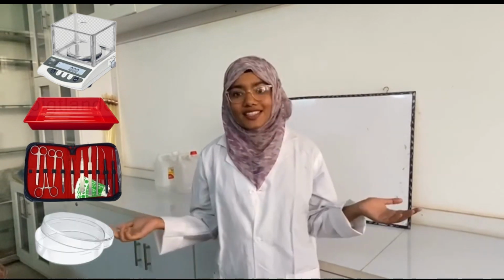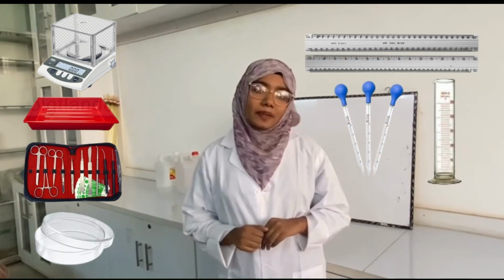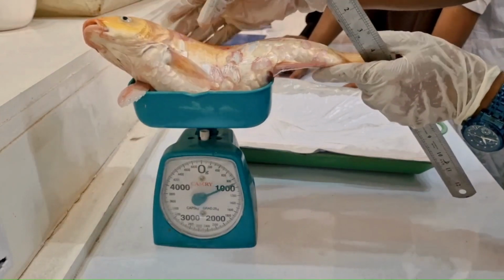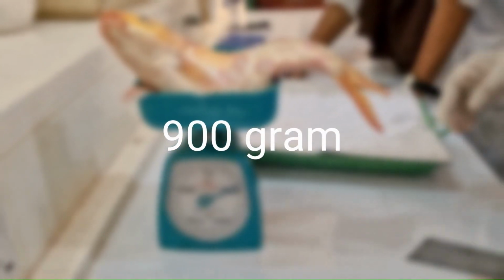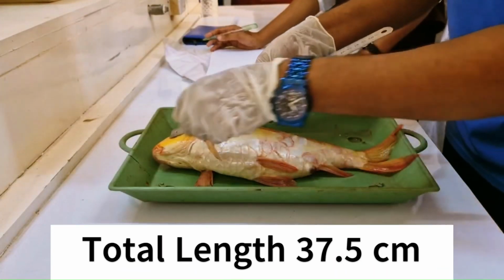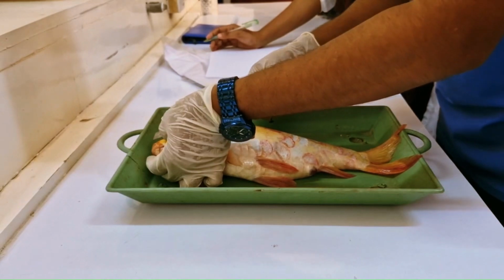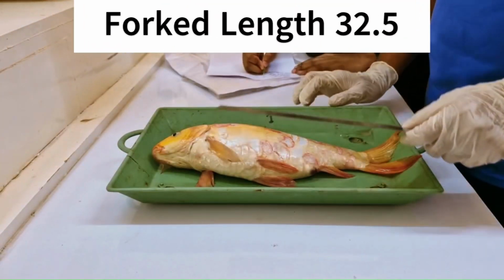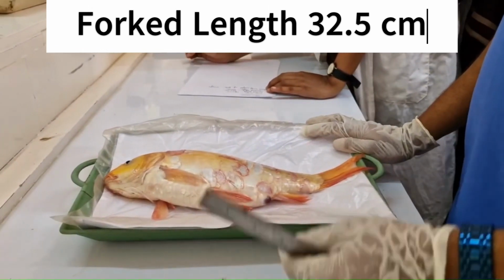Instruments used in this lab work are weight machine, tray, dissection tools, petri dish, scale, measuring cylinder, pipette and gloves. Gravimetric method. At first, we weighed the fish and the fish was 900 grams. Then we put it on a tray and measured the total length, which was 37.5 centimeter. Standard length 30 centimeter. Fork length 32.5 centimeter.